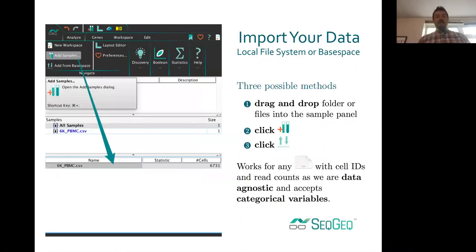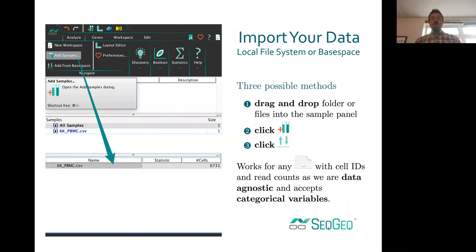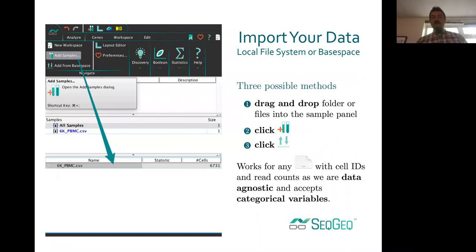The first step is probably going to be importing your data from wherever you have it stored. We support drag and drop import — if you have a CSV file representing your expression matrix, you can drag and drop it directly from your desktop into the workspace. You can also click the add samples button, or load directly from BaseSpace if your data is stored there.